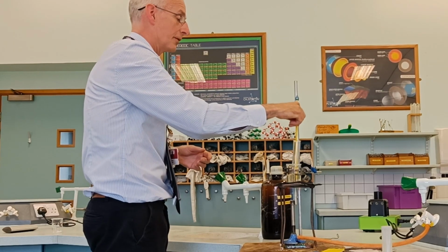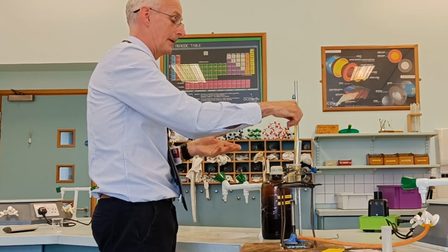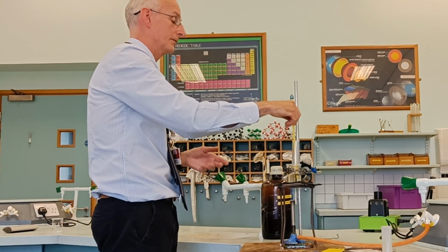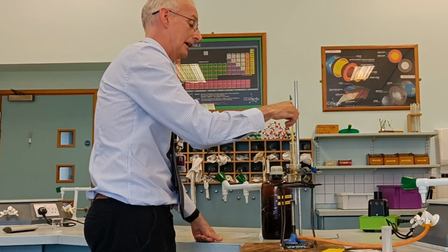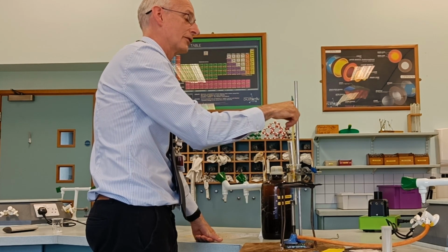But the melting point is quite high, so I'm going to heat this up. I'm roasting it at the moment to try and get it to about 100 or so, because I know that we're heading for the target temperature of 122.